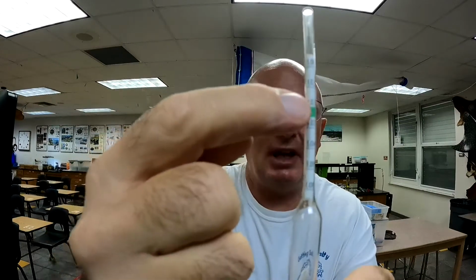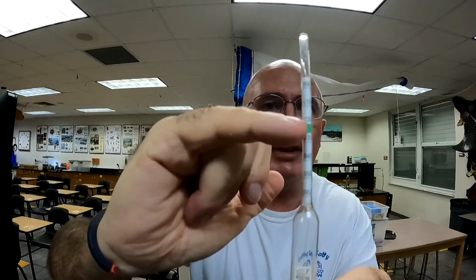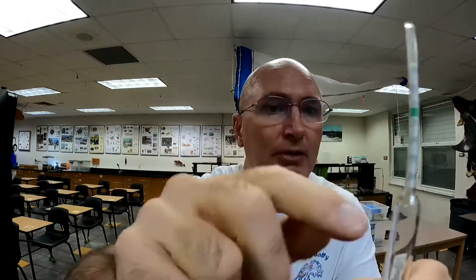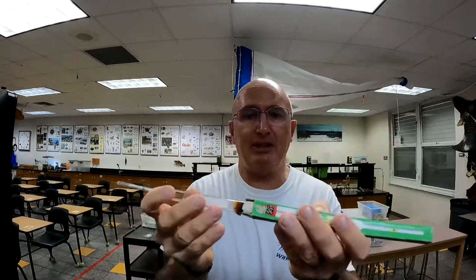You're going to look at the number where the water level is and write that number down or enter it into your lab. Also, you need to notice and record the temperature of the water. There is a place for that in the lab write-up. Once you're done, place the hydrometer back into the cardboard box. It is glass, so we want to protect it.